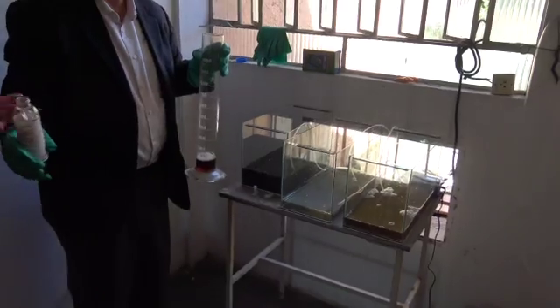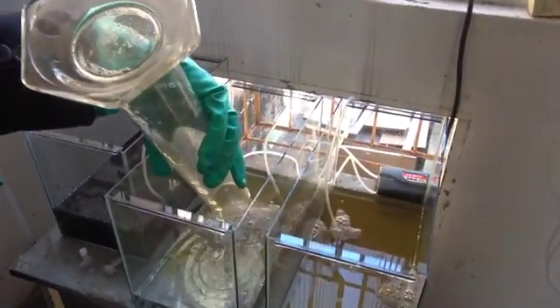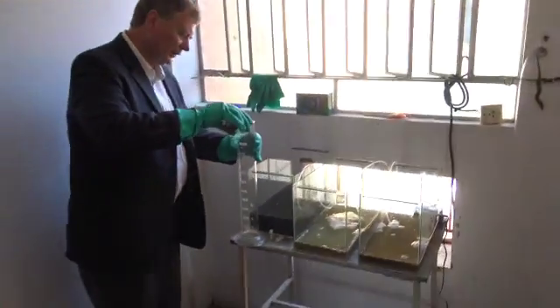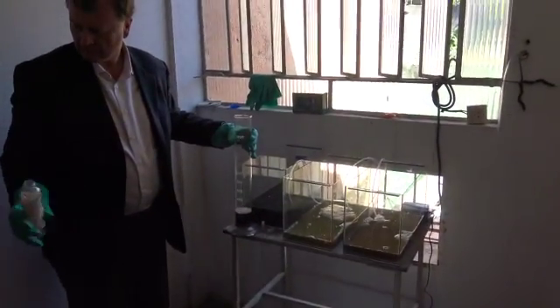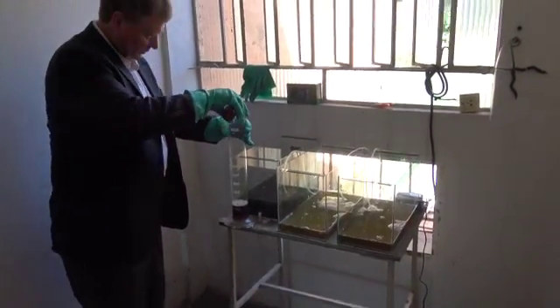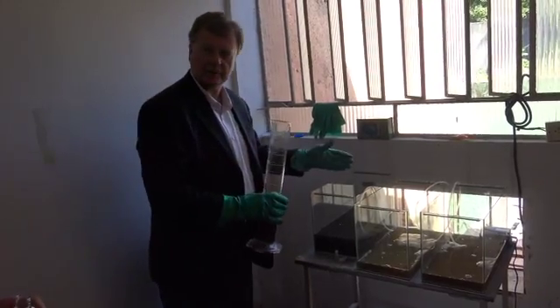100 milliliters in this one. And we're going to put 300 milliliters. I'm going to need another one. 300 milliliters in the sediment and water.